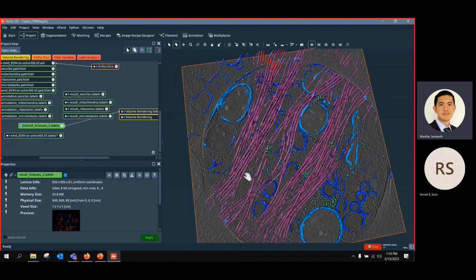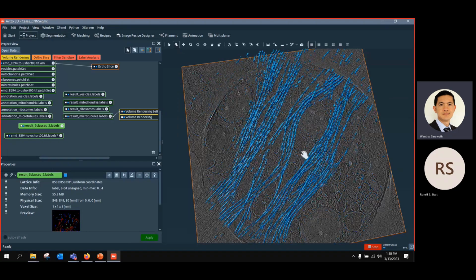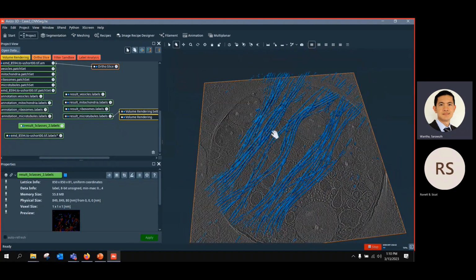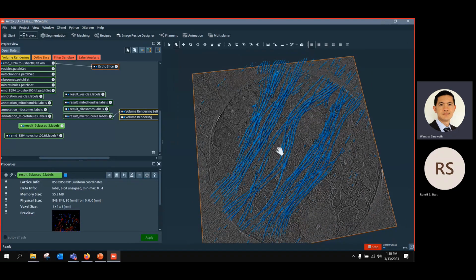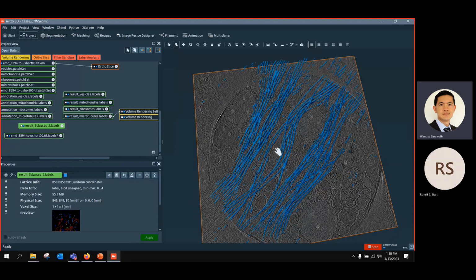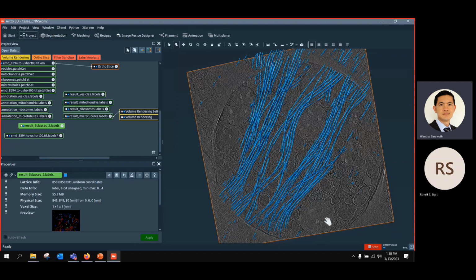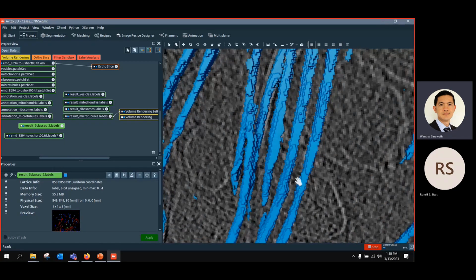So this is a combination of our labels, but the individual labels you can see here, for example, microtubule. And in this example, which we will see tomorrow, you can use this as the input ground truth image for deep learning. Instead of manually drawing, even with the mask tool or the superpixel, you still cannot draw this as accurately as this.